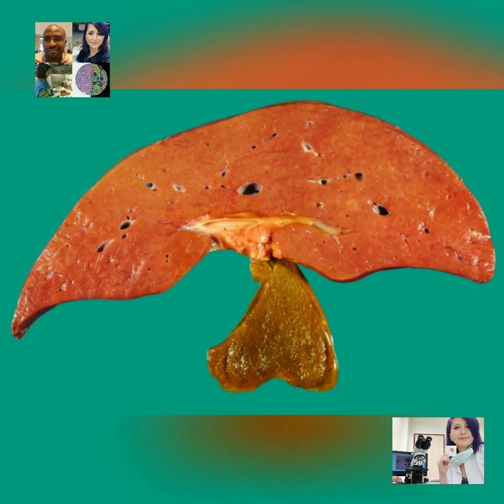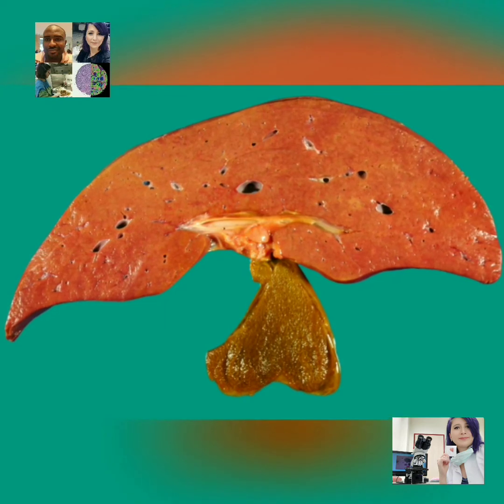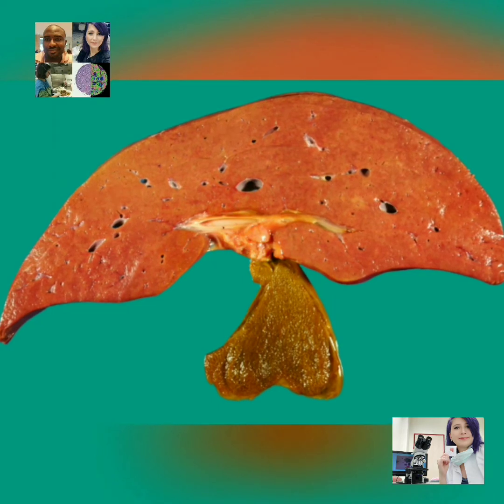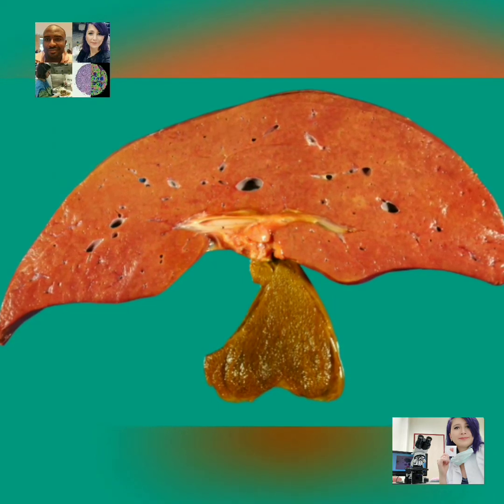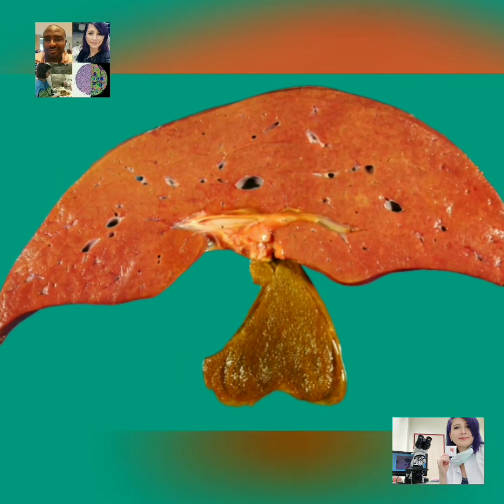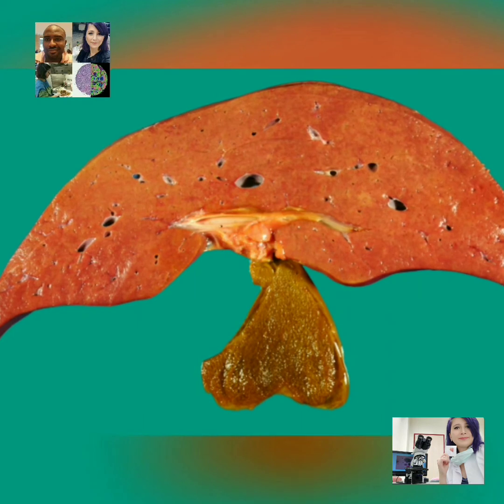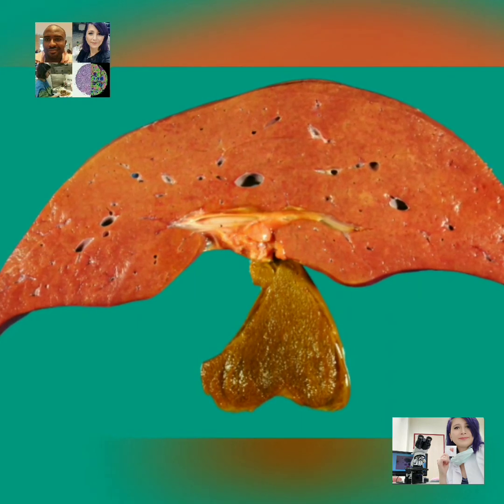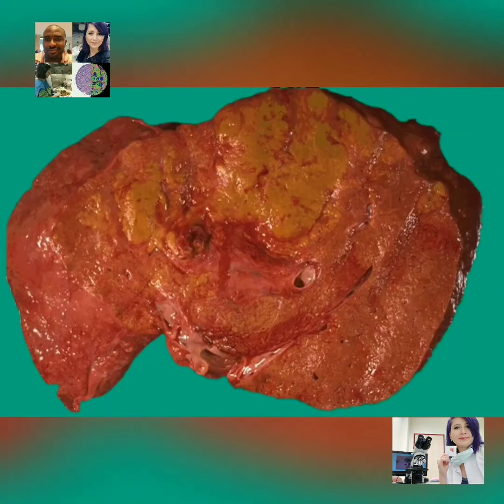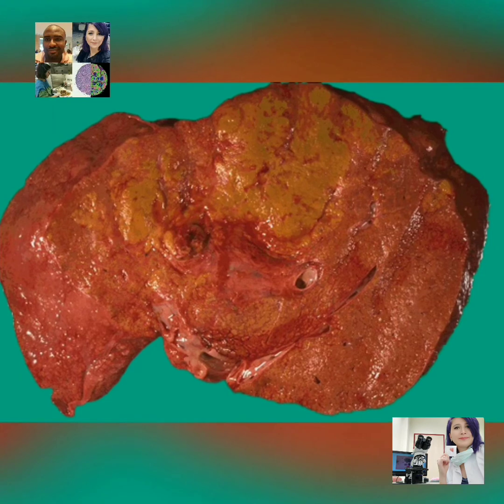Occasionally, lymph nodes may be harvested from hepatectomy samples. When lymph nodes are present or when they are retrieved, the region from which they are retrieved or harvested should be described appropriately. The numbers of lymph nodes received should also be noted, along with their individual sizes, usually measured in 3 dimensions. Attention should be paid to the maximum diameter of each of the lymph nodes. It is important to note that each lymph node is separated.